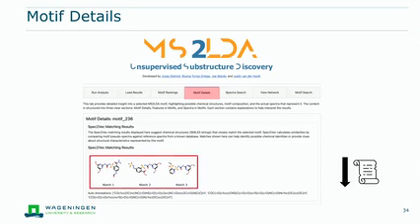So those are all the structures. And what Rosina explained earlier, how do you interpret that? What we would do now is have a look at all the structures and see what they have in common. And then you can maybe see it's this dimethoxylated ring system up to the sulfur group that is in common, or shared by all of those structural recommendations, and that is probably already a really good lead for what substructure is represented.